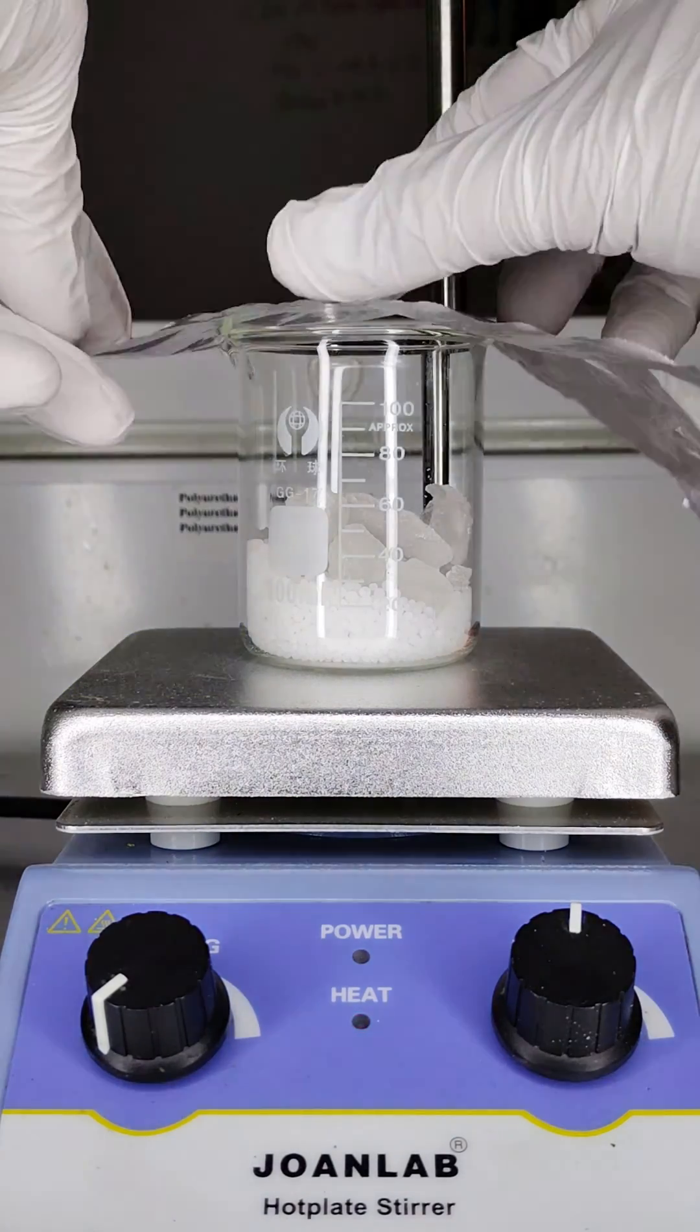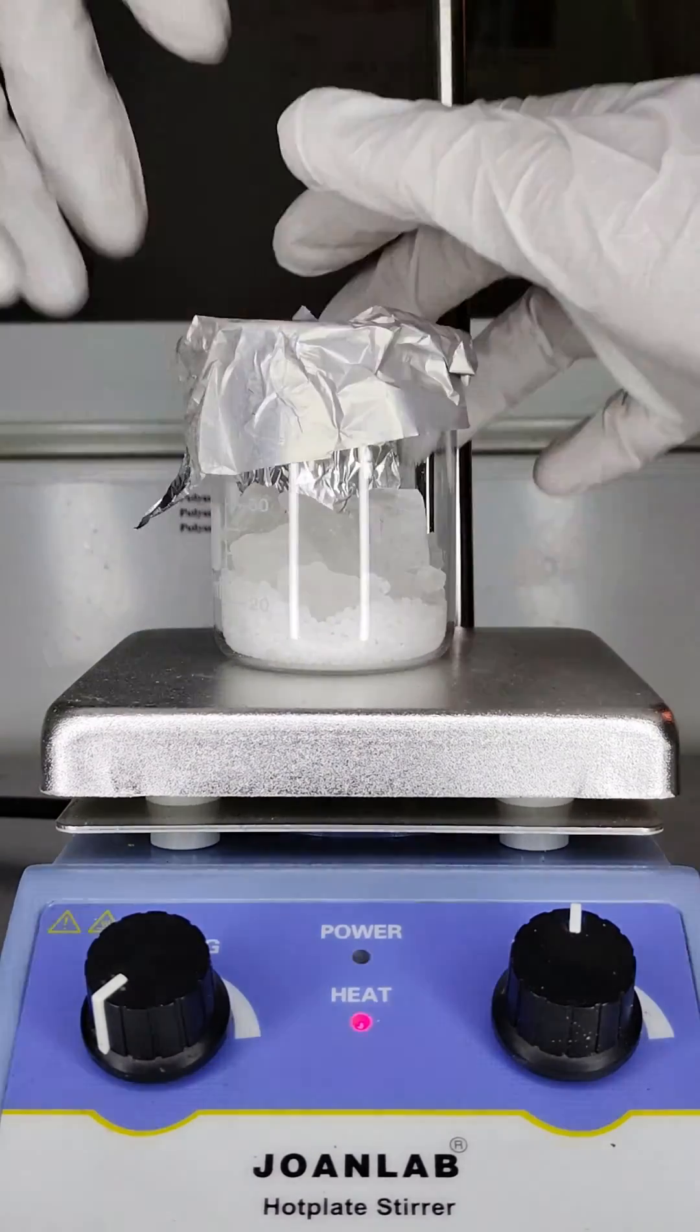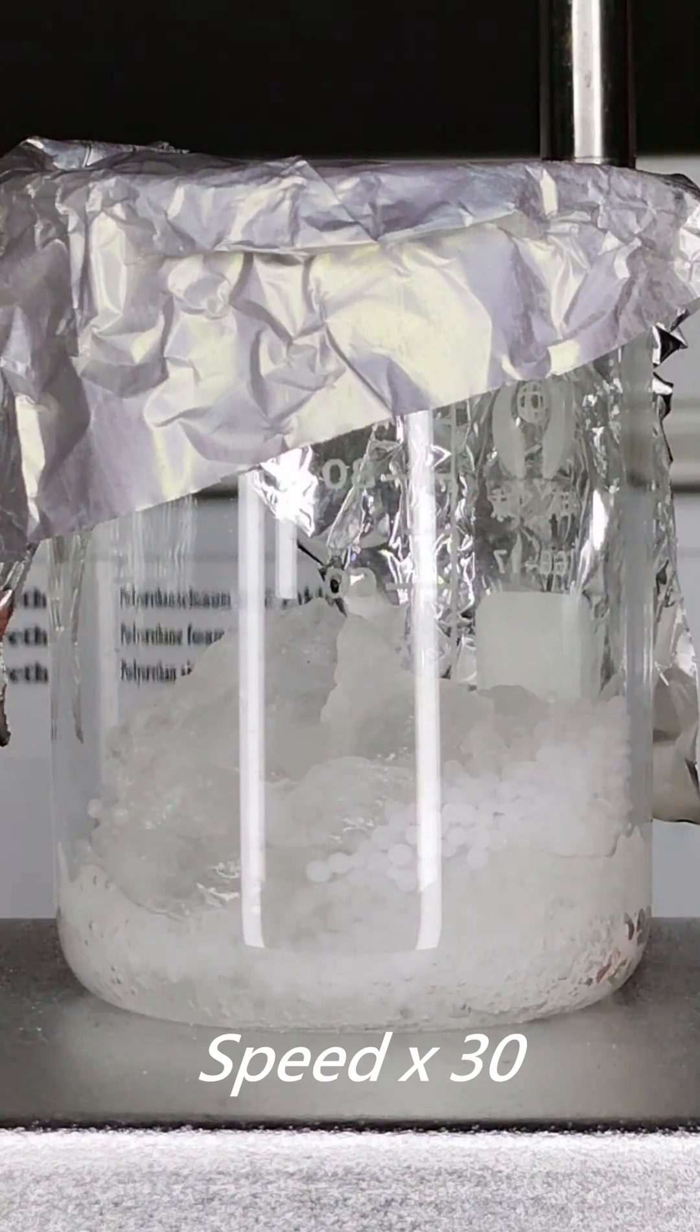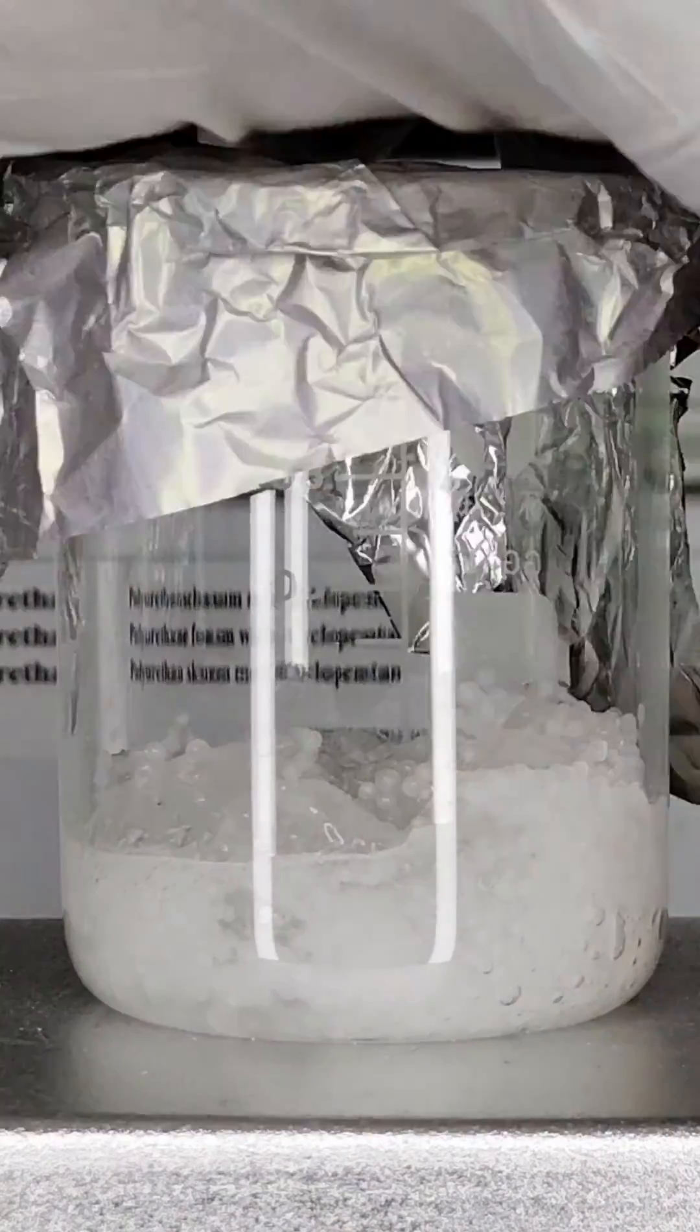Start by preparing a clean glass container. Add the desired aluminum compound, alum, into the container. The choice of aluminum compound depends on your specific requirements.